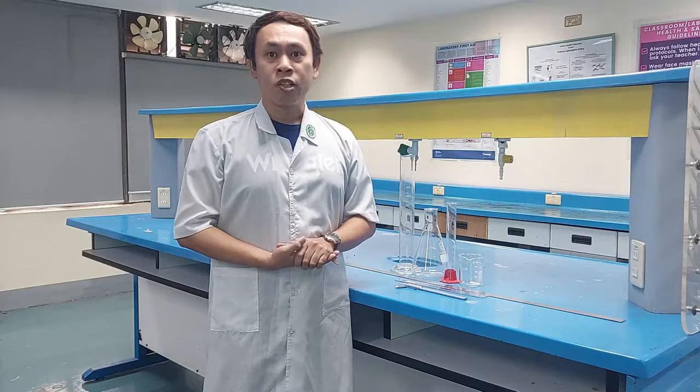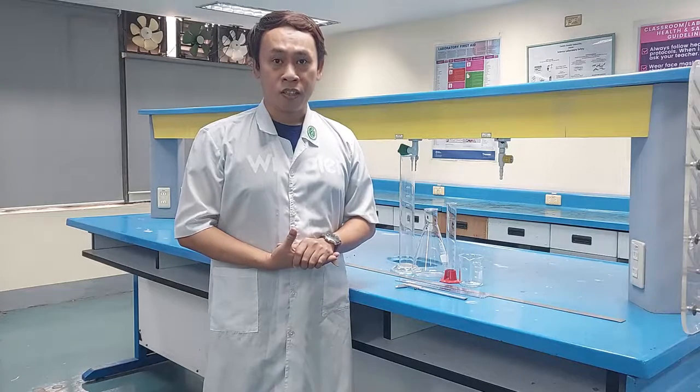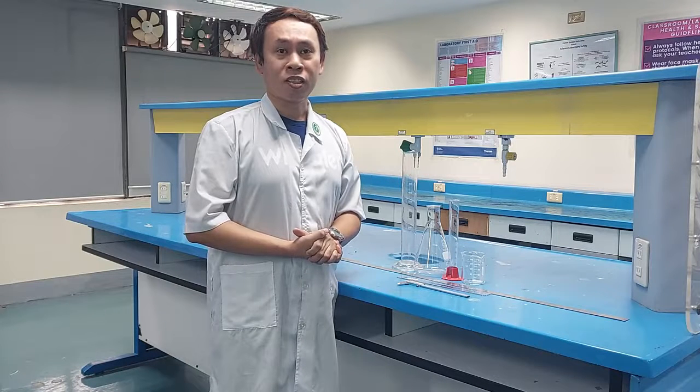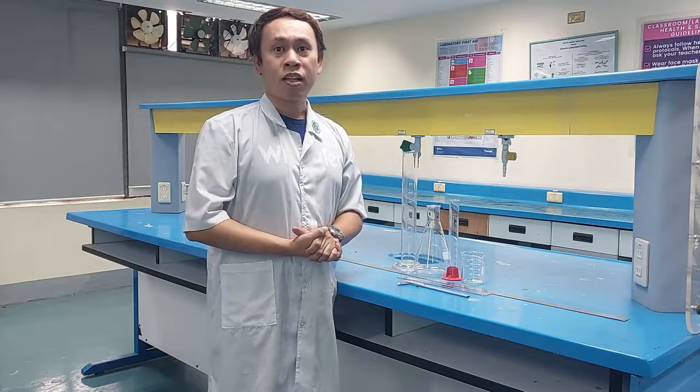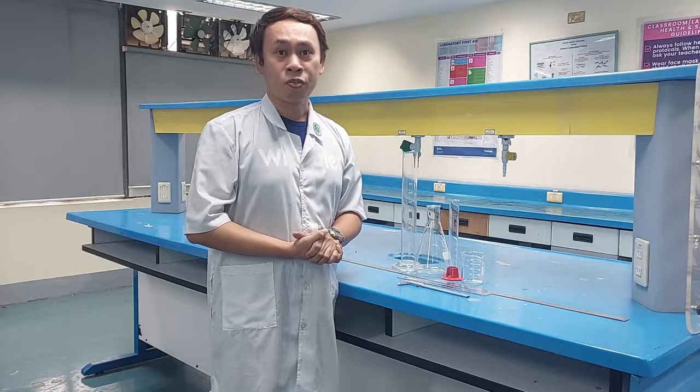The two systems of measurement used by scientists are the English system and the metric system. However, as you're probably aware, most scientific data is reported in metric units. Measurements are made using an instrument marked and/or pre-programmed in standard units, a mechanical balance, and a device that can be manually set to deliver a specific volume.